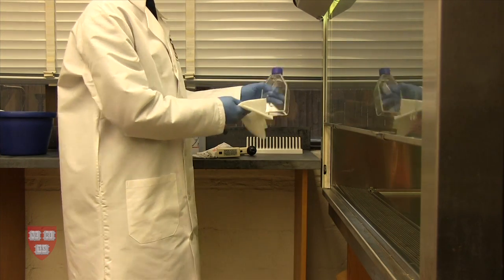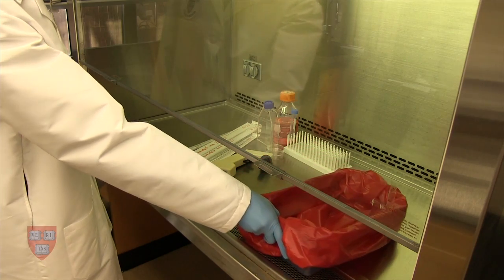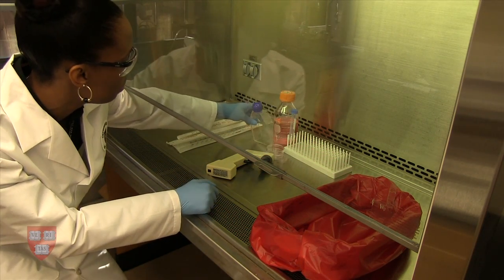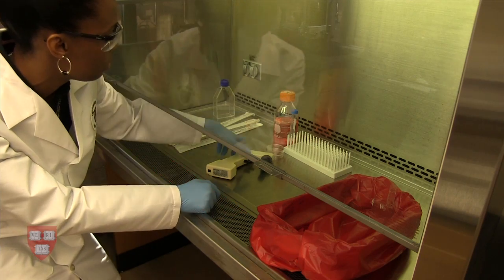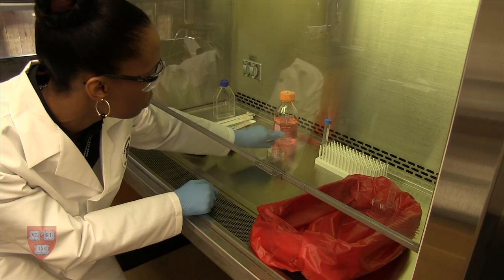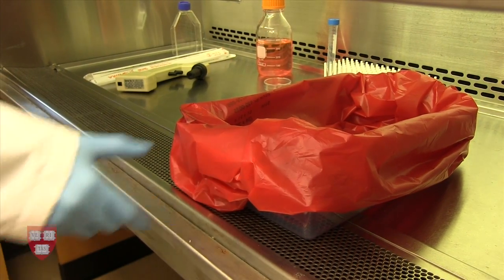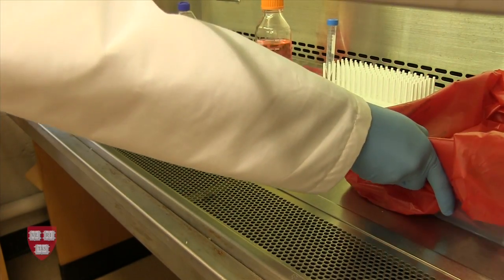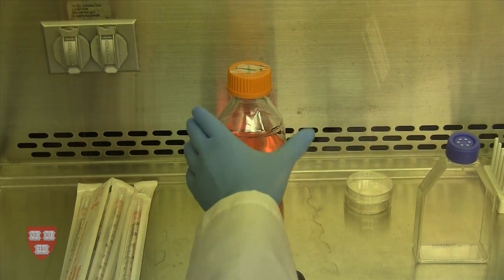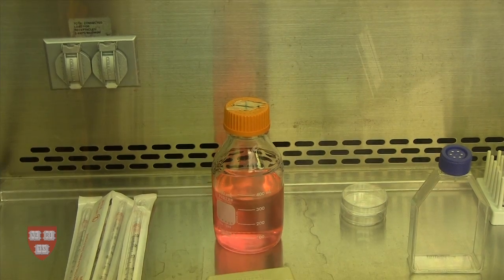As you continue to set up the BSC, do not overcrowd the workspace. Overcrowding can interrupt airflow, which can make the cabinet ineffective. Keep the air intake, which is the vent in the bottom of the sash underneath your elbows, clear of all items at all times. If this vent is blocked, it allows unfiltered air to enter the hood. This can contaminate the work and possibly endanger you. Also, keep items from directly blocking the vent in the back of the hood.